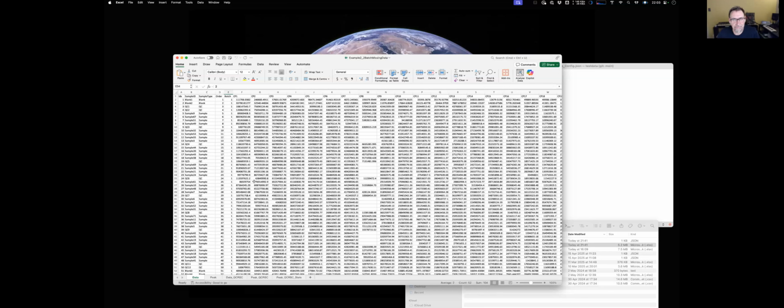For most metabolites, certainly for clinical stuff, endogenous metabolites, there is no limit. It's not going to be diluted. The only time where that can be an issue is when you've got drugs or drug metabolites. Occasionally, yeah, I mean, it's all drugs, stuff like caffeine. You might have one person who has got a massive caffeine feature, and then when you pool it, the QC is artificially raised by the amount of caffeine in one sample. I very rarely see a problem in the opposite direction, but it can happen. But it's just the nature of the method.